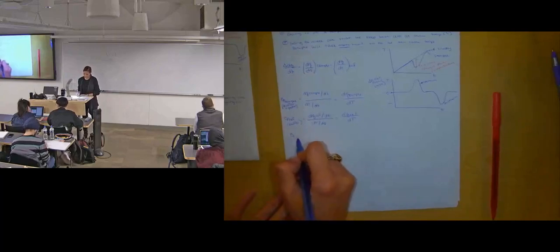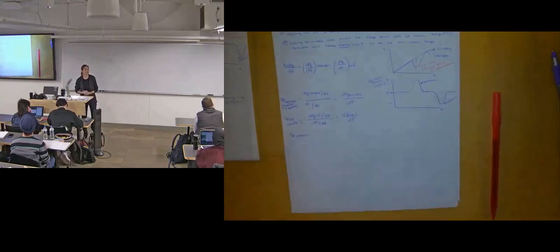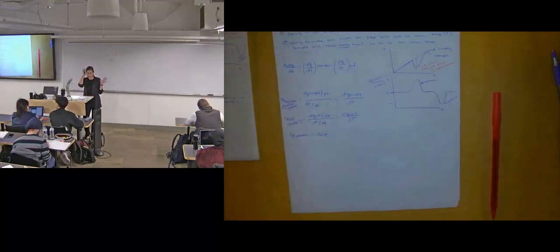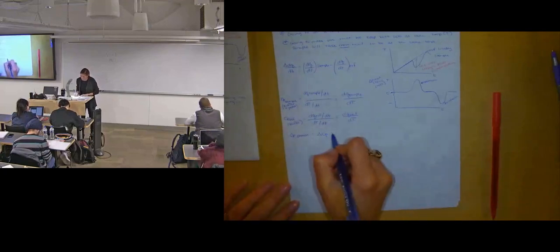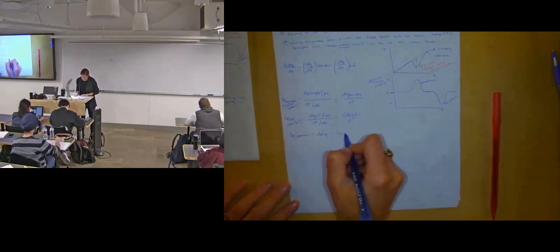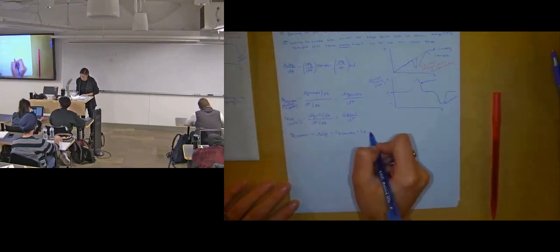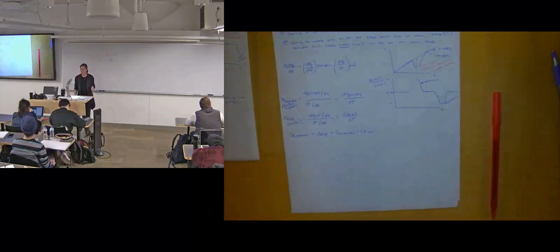So how do I get the CP of just the protein? Perfect. Okay. What Amanda said, to get the actual CP of just the protein itself, just the part I'm interested in, I need to do the heat capacity of the sample, buffer and protein, minus the reference, just the buffer. Okay? Take the piece that has both, subtract out the background, the buffer part, and I just have the protein left.